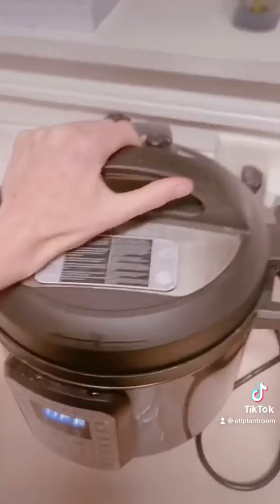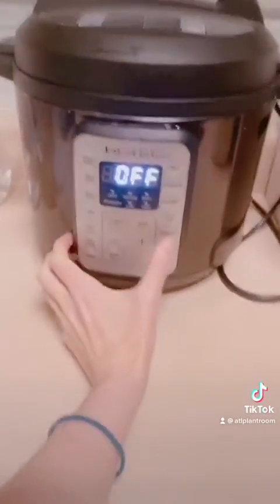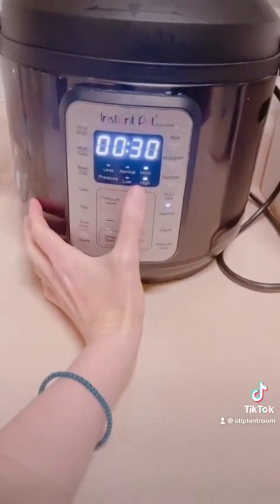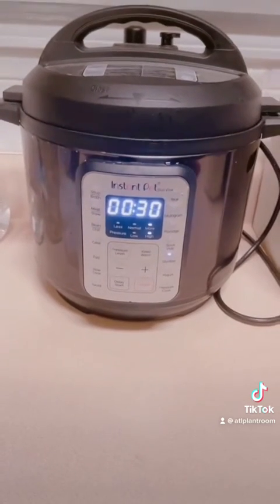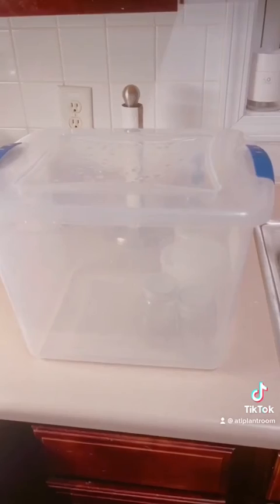Now let's close the lid. Set it on sterilize and then high, and more, so it'll be 30 minutes. That's basically it. Once that's done, we'll put it in here and take it downstairs.